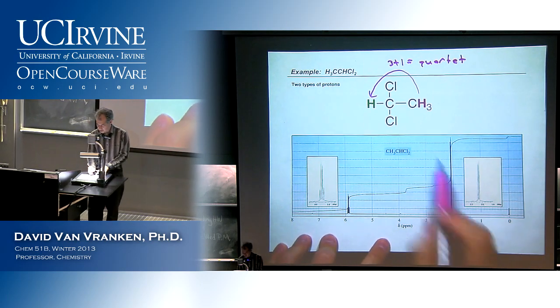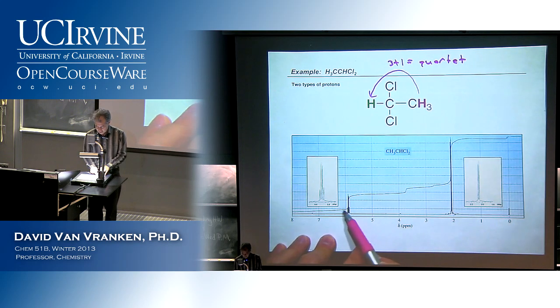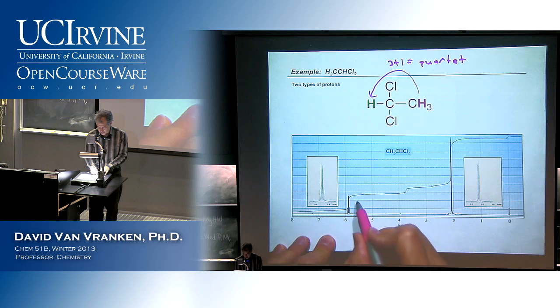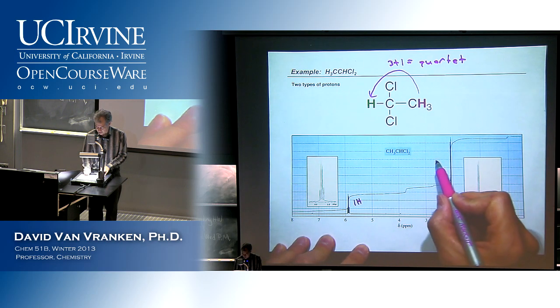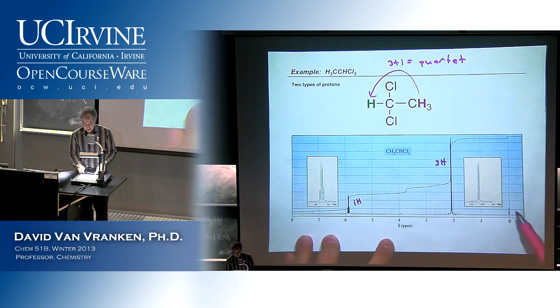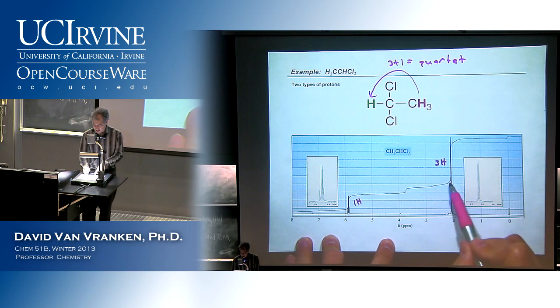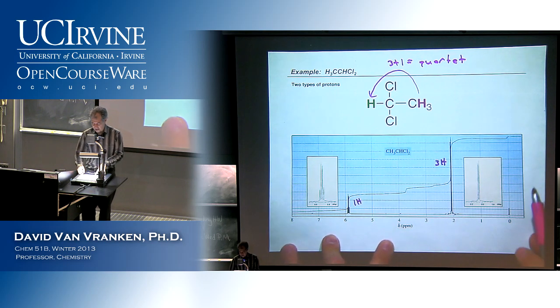Okay, let's come over and look at the CH3 group. If I look at the integration, there's this lame integration line here. If I took out a ruler and measured, that would correspond to some sort of area under the integration line, and however far up I go with my integration line, it's three times higher than I went up with this first one. So that corresponds to the fact that the area under these two peaks is three times bigger than the area under these four peaks.